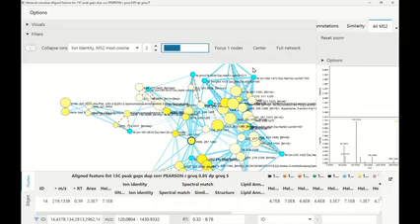Makes sense. Okay, so this is a network visualizer, and it's definitely good to play around with, and it's a bit more dynamic. There are other tools out there like Cytoscape, which is amazing. You can export this and plug it into Cytoscape, and from there visualize everything more nicely for your paper, and then of course polish it.